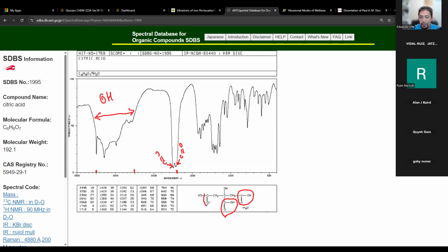And actually, I have three carbonyls. Oh, wait, no, I have three carboxylic acids. Oh my goodness, sorry, I did not see that. Yeah, so that's why you get this broadening of this carbonyl signal there, right? We find it where we expected, but it doesn't look like usual because the molecule itself is different. This is what we mean by fingerprints. The molecule has a unique signature.